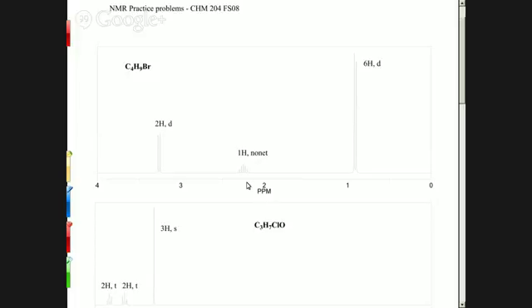Well, that's now the challenge. You have to start piecing this thing together. So you've got this group of 6 is a doublet. What does that tell you about the two CH3s? If it's a doublet, how many hydrogens are adjacent? Right. So that means that the CH3s have to be next to a carbon with one hydrogen, the CH.